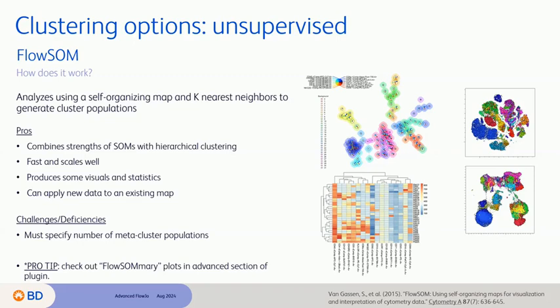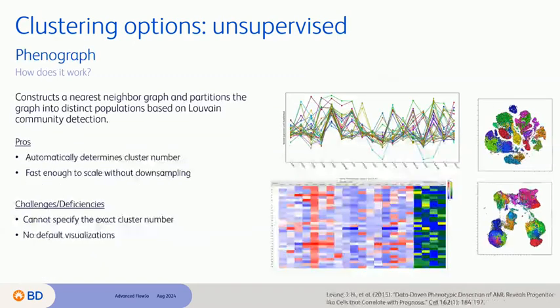But all these plugins will output results in the output folder. So look for R script, Phenograph text file. And if you have that text file, you can just send that in to flojo@bd.com, and then I can take a look at it and help you from there. It's kind of the easiest way, is just to see what's happening from R. So that rscript.phenograph.txt file has that information.